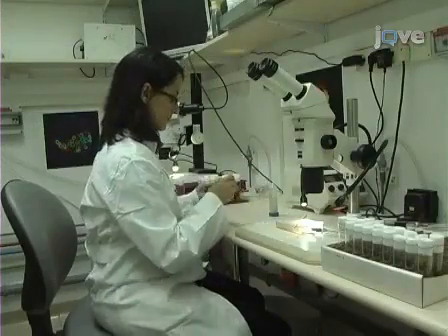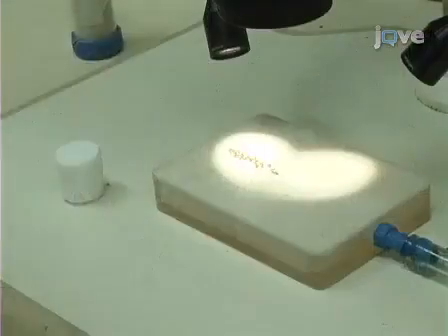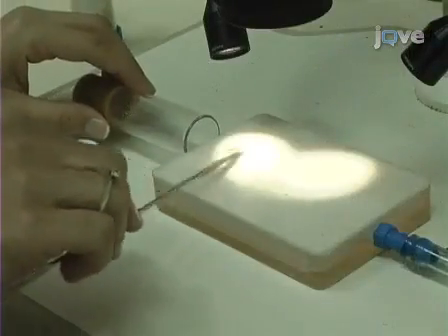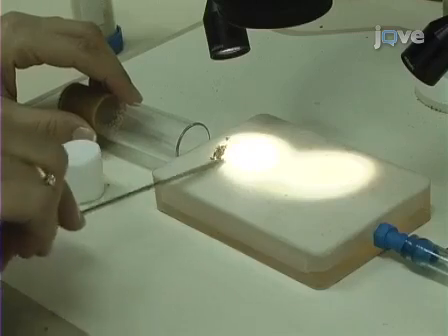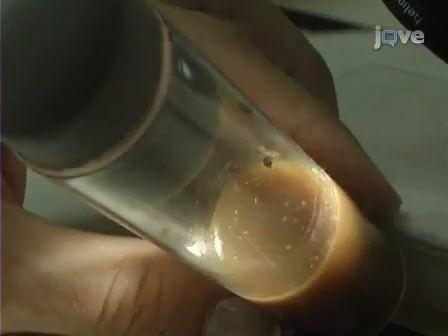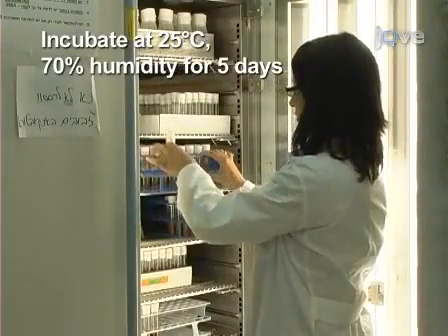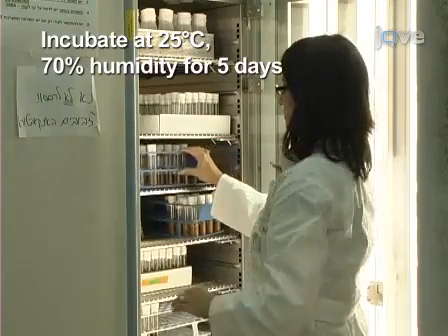Five days before dissection, add yeast to a fresh 25-millimeter vial of fly food. Place 7 to 16 mated female fruit flies into the vial. Allow the females to lay eggs for 2 to 4 hours, or until there are about 30 eggs per vial. Incubate the egg-containing vials at 25 degrees Celsius with a minimum of 70% humidity.